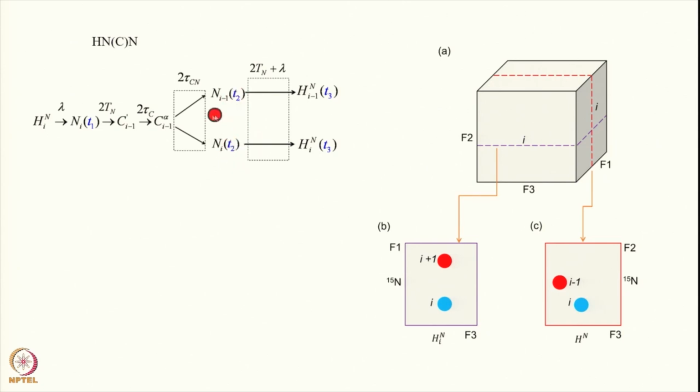Here you have a frequency label, you call this T2, and the T1 is here. Therefore along the N15 axis you have the T1, and here you also have the T2. Then from the nitrogen you go to the amide proton. Also in the previous one, T1 is N15, T2 is also N15, and T3 is amide.